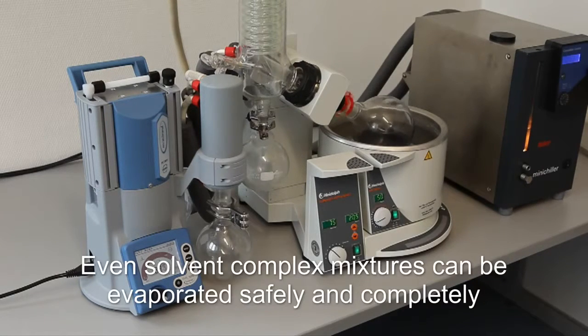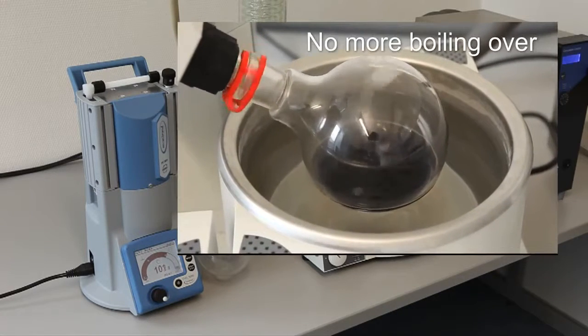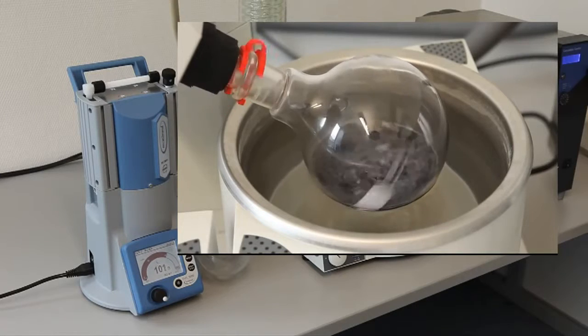Even solvent complex mixtures can be evaporated safely and completely. The controller of the PC-3001 Vario avoids the risk of the sample boiling over, ensuring always the perfect vacuum condition during the entire process.